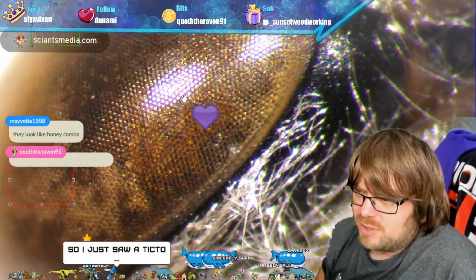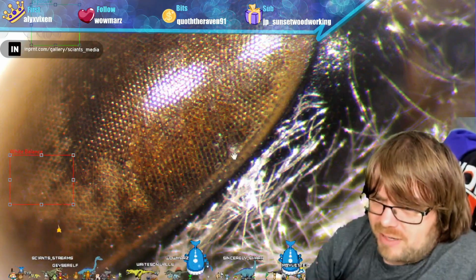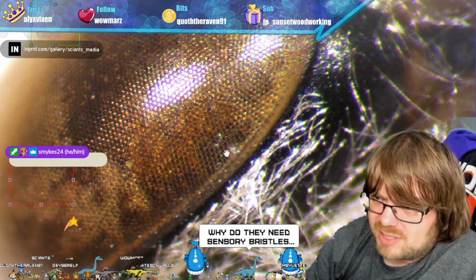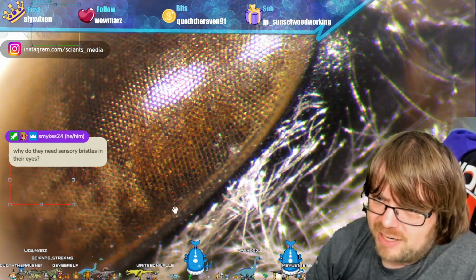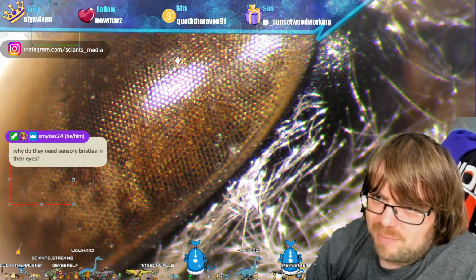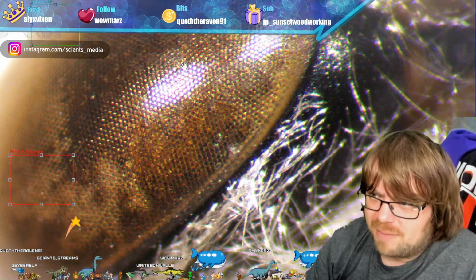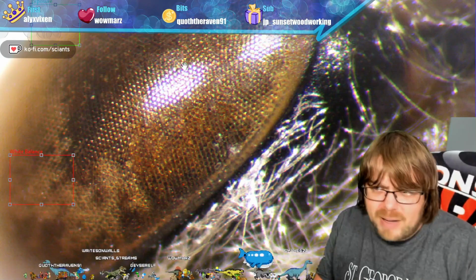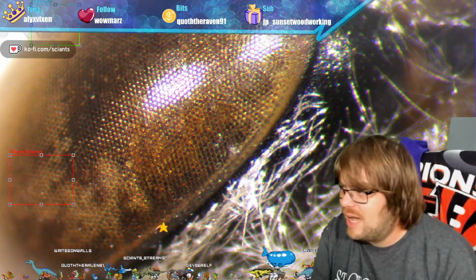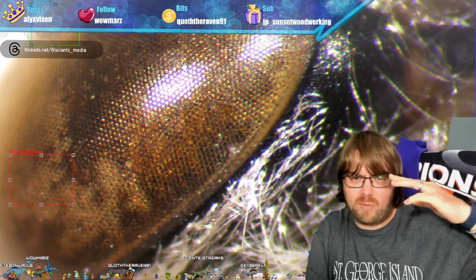There are sensory bristles. Where you'll see differences are along the rim. So along the bottom down here, you'll see differences in the cell types. Not necessarily the cell types, but the shape, just because they're terminating at this edge. But if you were just to take an image here in a scanning electron micrograph, they'd all look the same. They're pretty uniform on that front. The reason for that is from a developmental biology perspective, it's just easier to program having all the same cell type and appearance instead of having a unique and different one for each type.